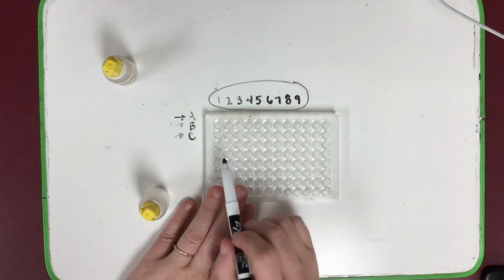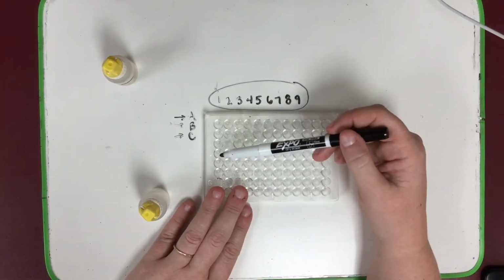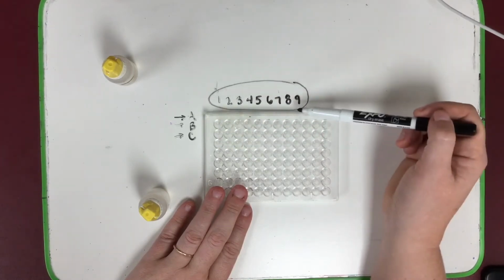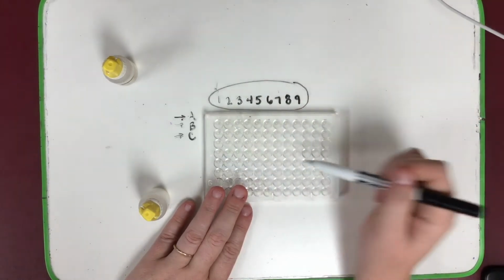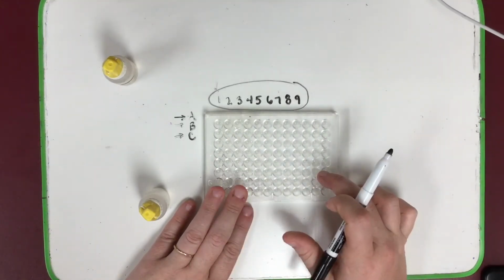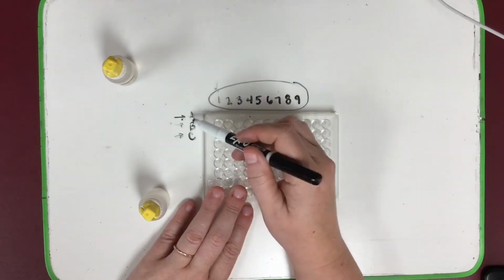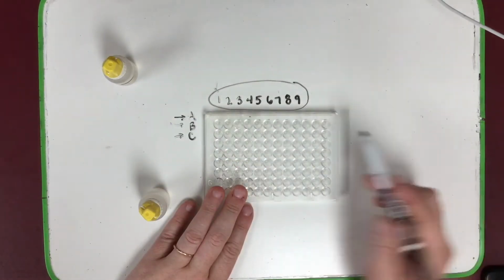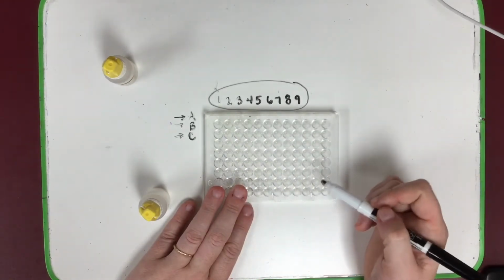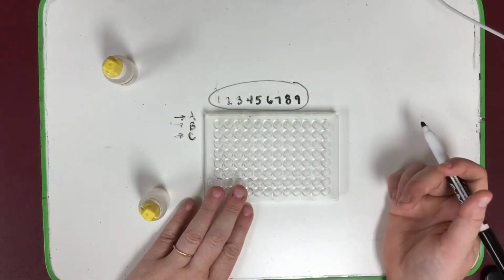When you are actually dropping your solutions in, if you get an immediate result, even before you add the second drop in, that just tells you that the cell itself was dirty. You probably just want to pick a different row and try again. Nothing says you have to use row A, B, and C as long as you remember where solution A, B, and C are. Similarly, if you get a lot of weird results, you definitely want to just wash the entire well plate and start all over again.